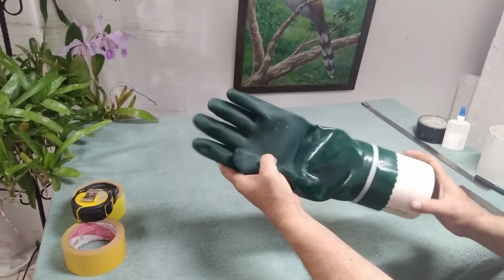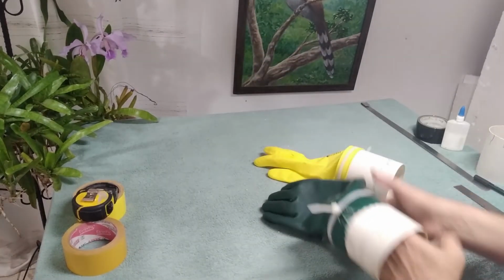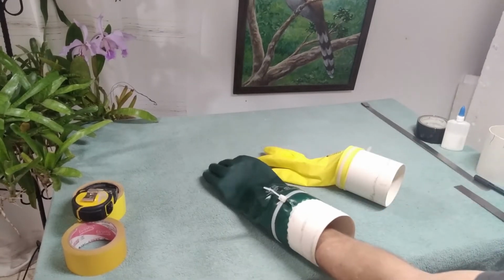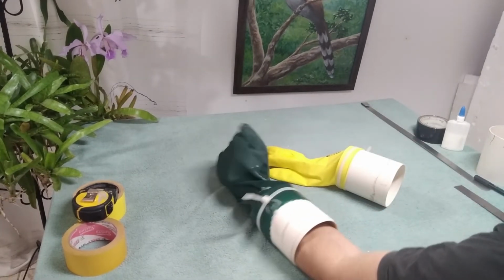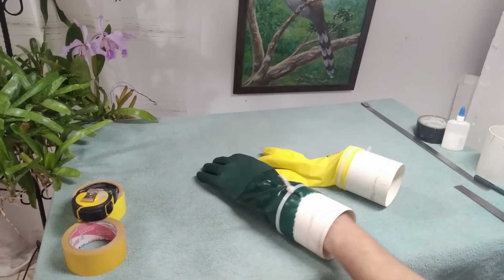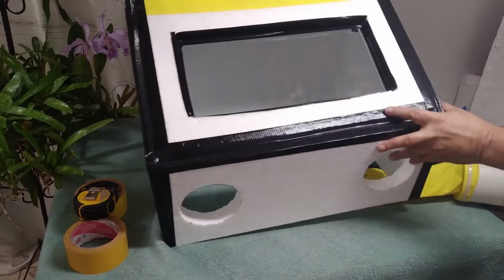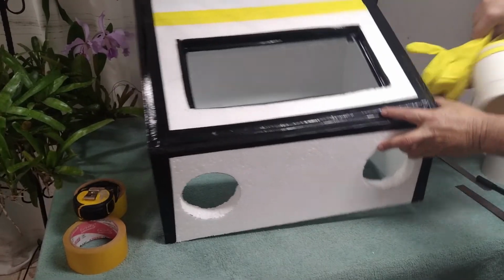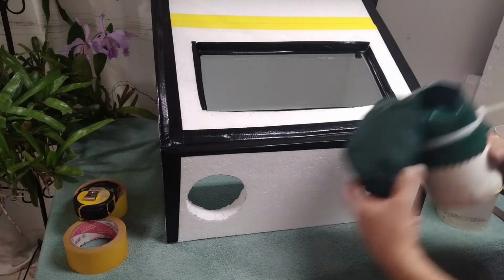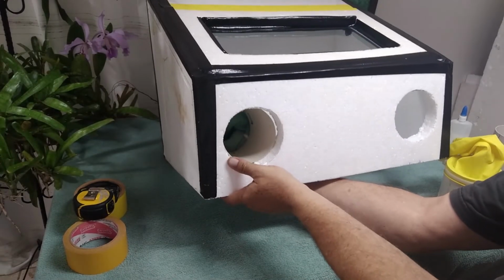This is a very large glove used by electricians. You can find them in stores where you buy safety equipment. See how easy it is to slide my hand in it? But it is terrible to the touch, and this hand will just play support role, helping the other hand. So that's it. Time to attach the gloves to the box.